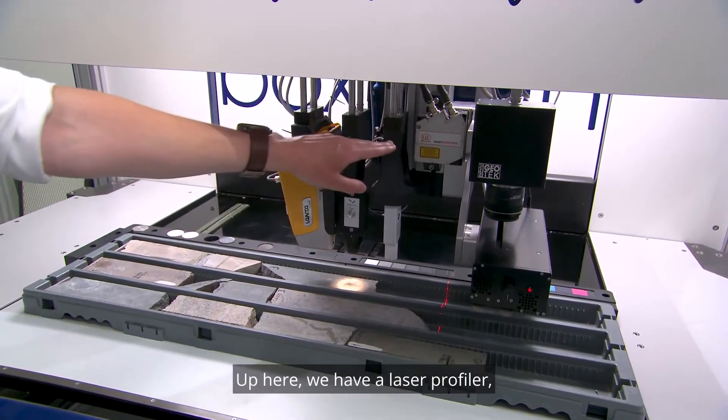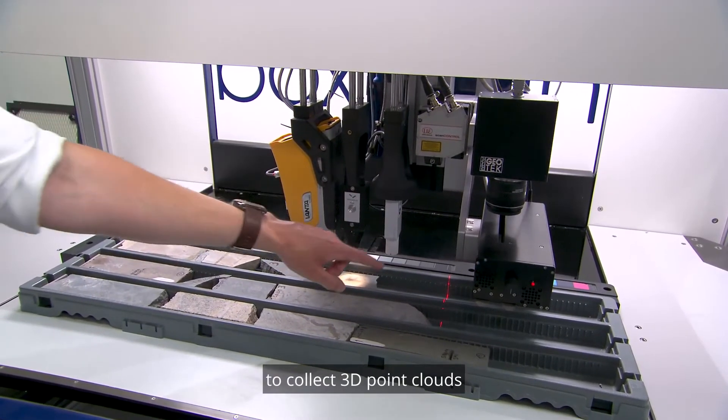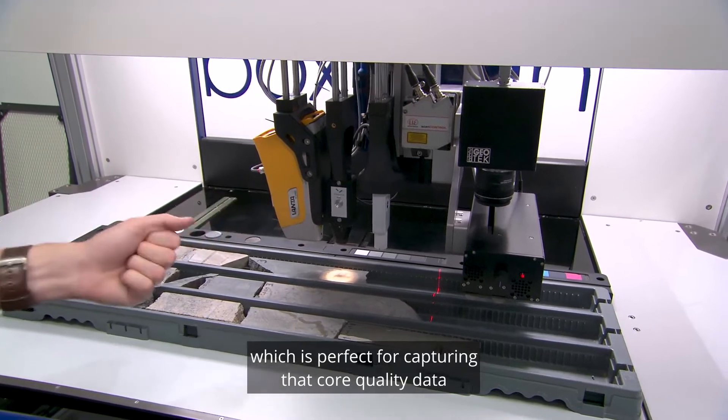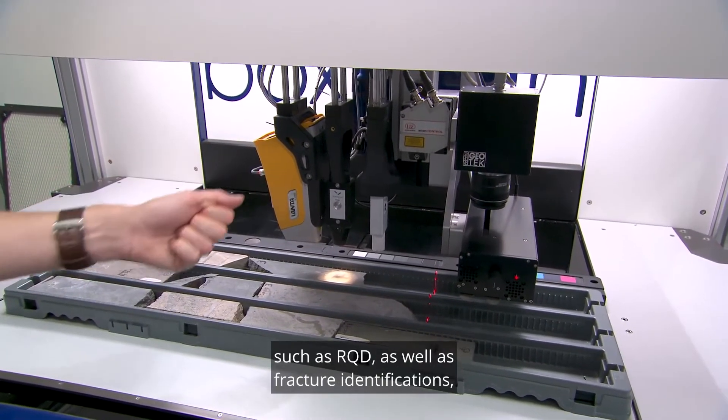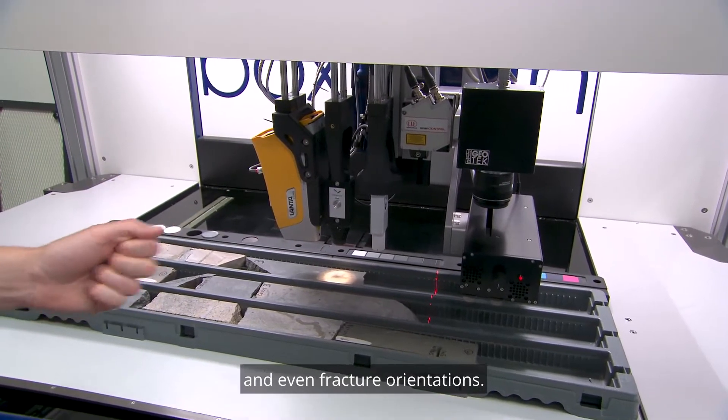Up here we have a laser profiler, which we can see measuring here to collect three-dimensional point clouds of the surface of the cores. This is perfect for capturing core quality data such as RQD, as well as fracture identifications and even fracture orientations.